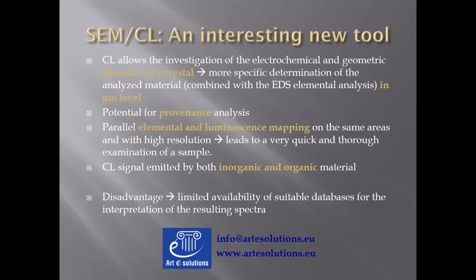The only disadvantage that this technique has, not the only, but the largest disadvantage that it has, is the fact that so far there are limited databases for material that is useful in cultural heritage studies. Which is exactly why we are open to any kind of collaborations in the future with any kind of material that could be useful in order to improve our databases and expand the applications that we can have with this new technique.